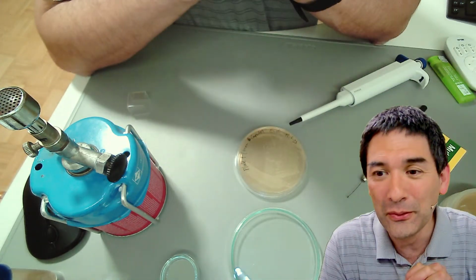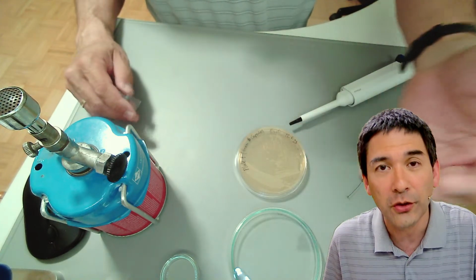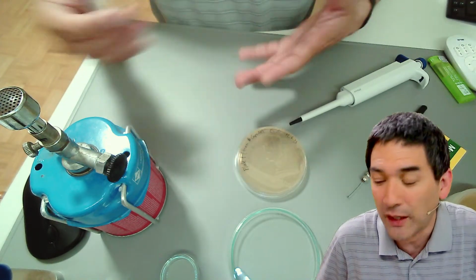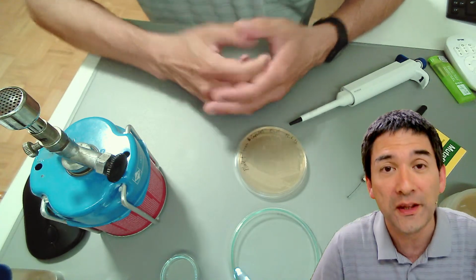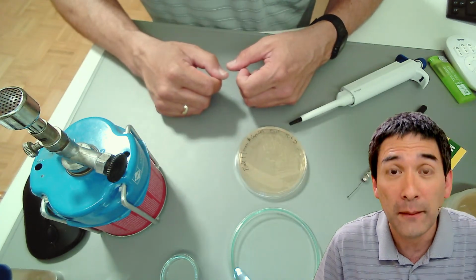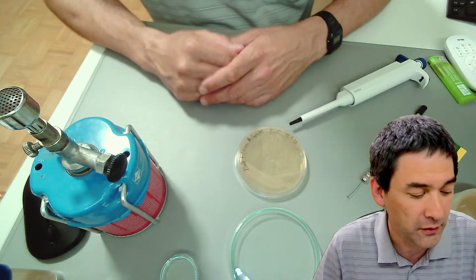I'm just going to get started now, and I'm not only going to show you what I'm going to do, but I also would like to explain a little bit the background of why I'm doing the things that we're doing. And I'm not saying that if you're interested in hobby microscopy, what I'm going to be showing you today is absolutely necessary to know, but rather I think it's simply an additional piece of information that you might find useful or not.